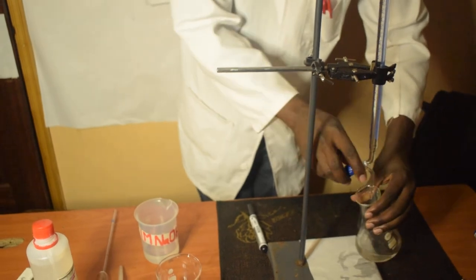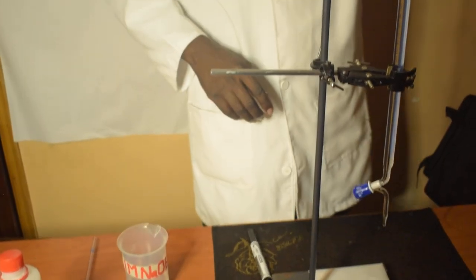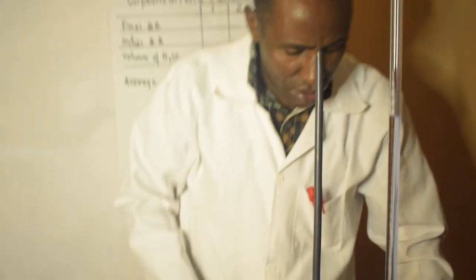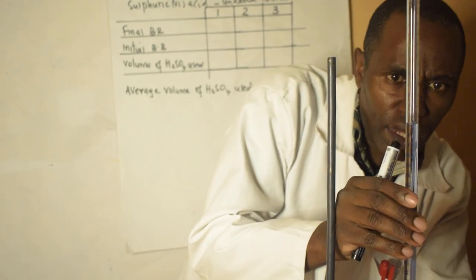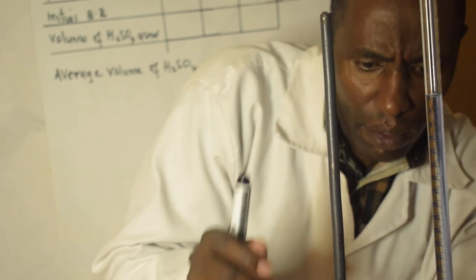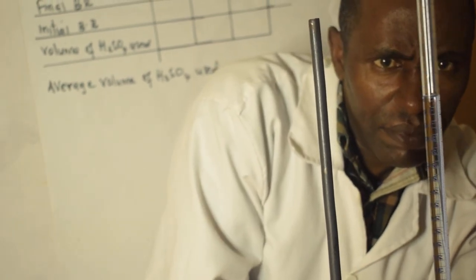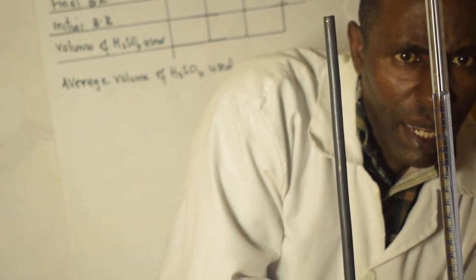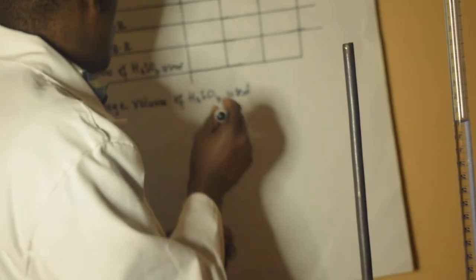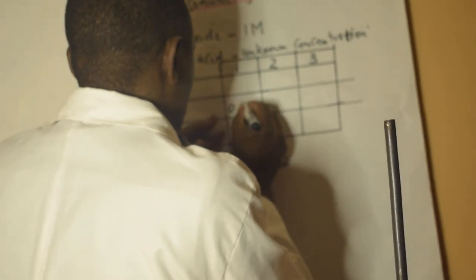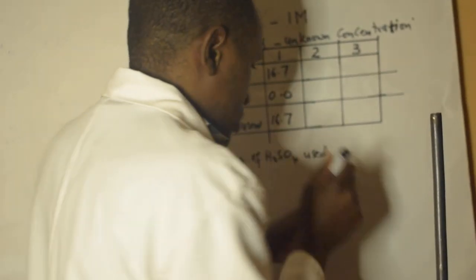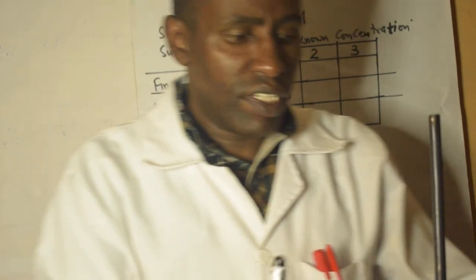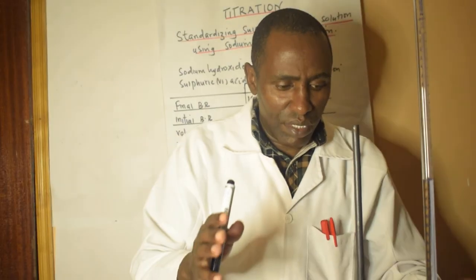The color has changed — the pink color has just appeared — and what I will do here is record the volume. I have 16.7 cubic centimeters. Now I'm going to do a repeat of the same — I'm going to repeat this three times to get the average titer.